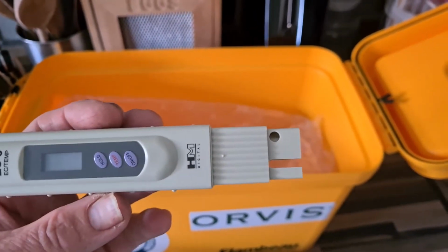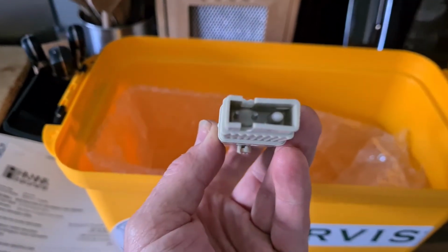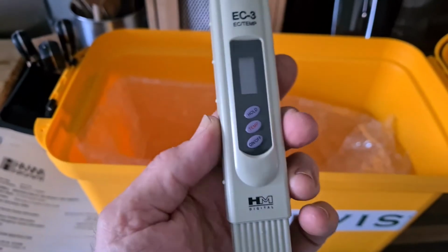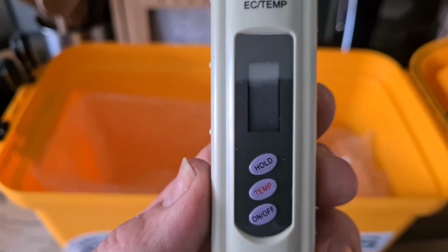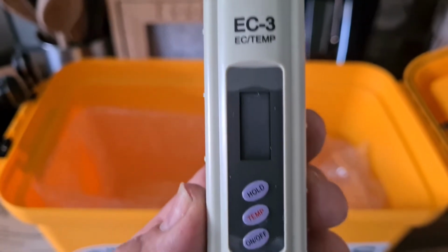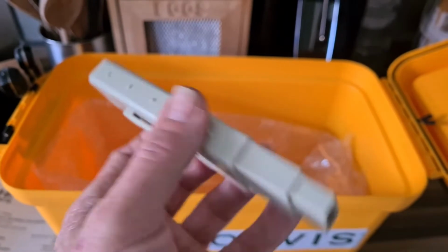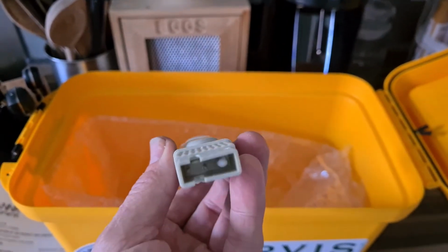There should be a cap on the end of that, but unfortunately it's come off in the case. There's the probe and the temperature sensors there. Okay, and you've got on, off, temp and hold. So you can switch between the electrical conductivity and the temperature. That already comes with the battery in the back. There isn't one to install.